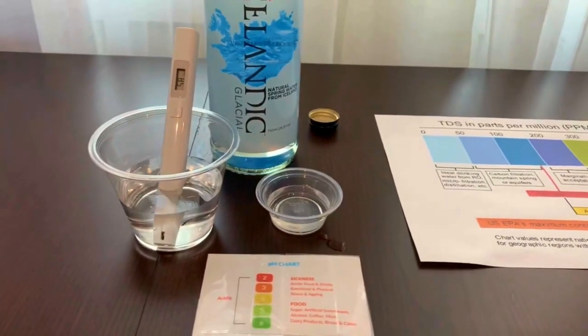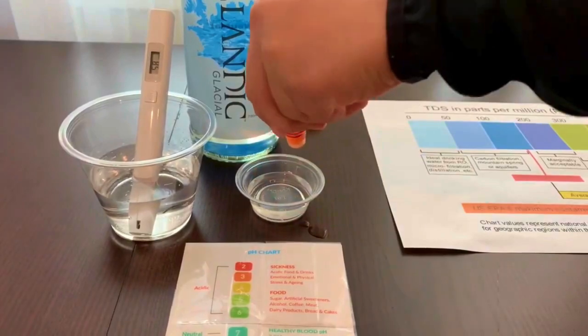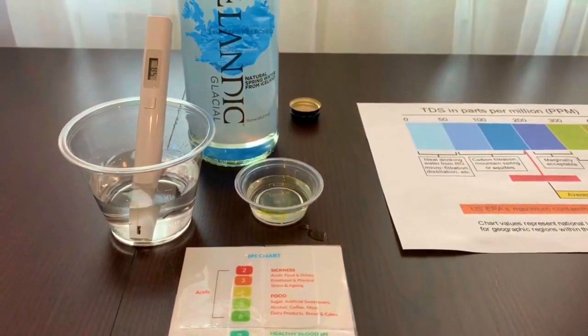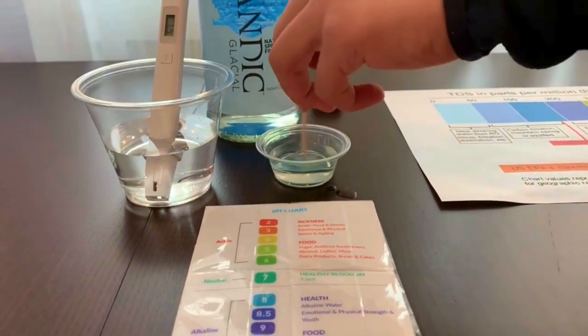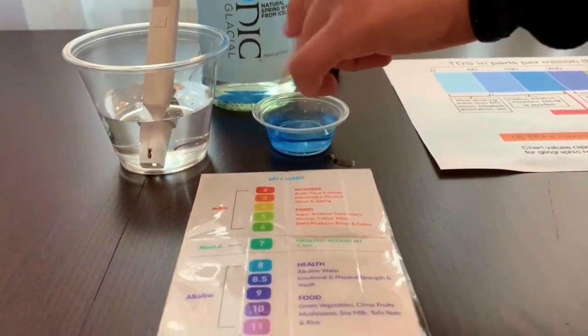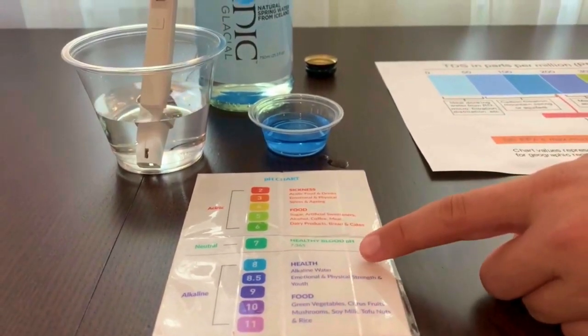Now let's test the pH level. Do two to three drops. Let's stir it a little for a better result. I give this an eight — this is alkaline water.